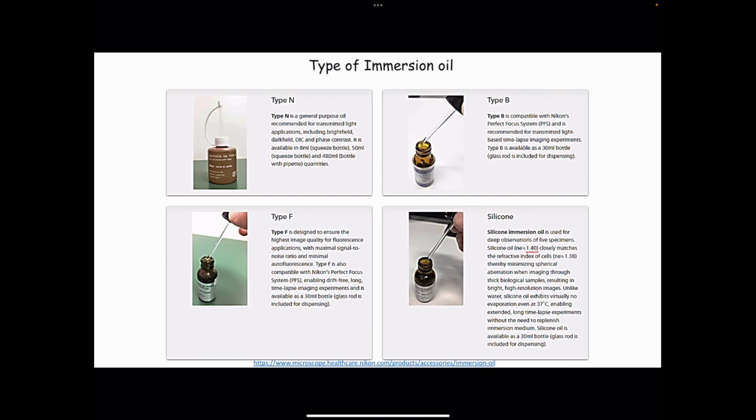In order to do that, you can use a silicon oil, which gives you high thermal compatibility, because for a sample used for long hours of imaging, even if it gets heated because of high laser intensity, the oil will not degrade, as a result of which sample integrity is maintained throughout the long hours of imaging and the time-lapse experiment.